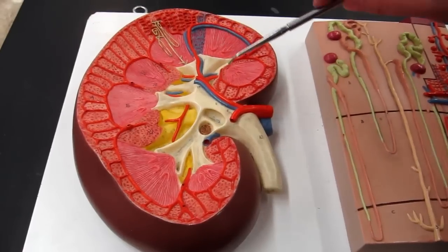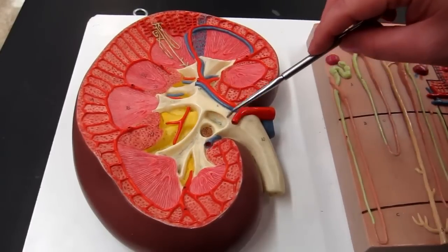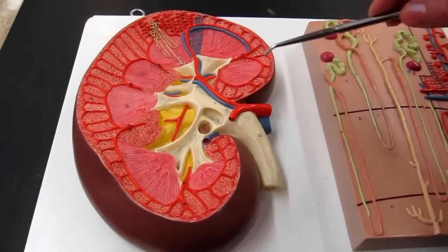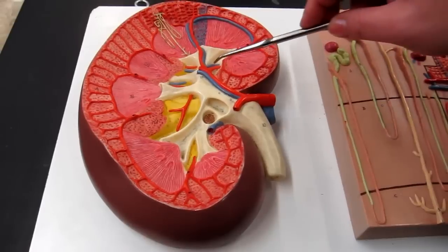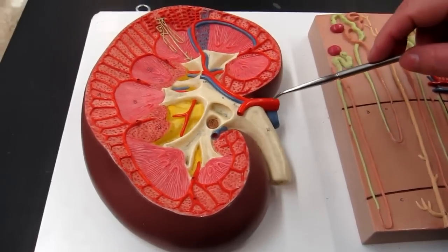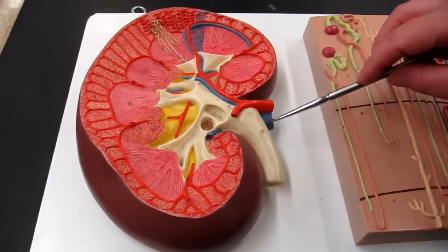Okay, and then the minor calyces lead to a major calyx. The major calyces lead to the renal pelvis, and then the renal pelvis leads to the ureter. Okay, here's probably a better major calyx up here. Okay, then we have the renal artery and the renal vein.